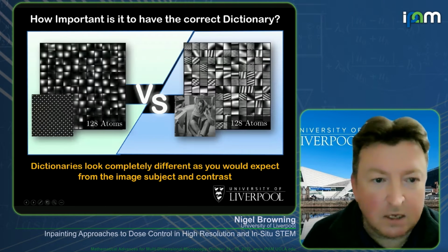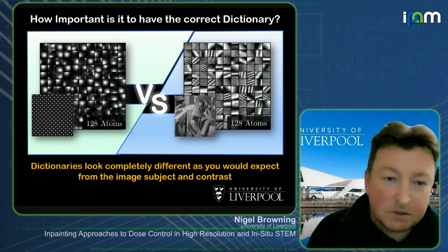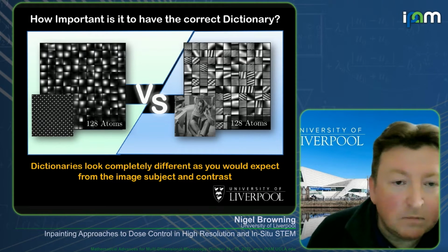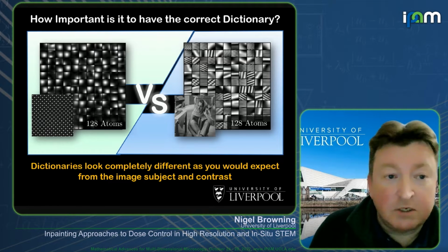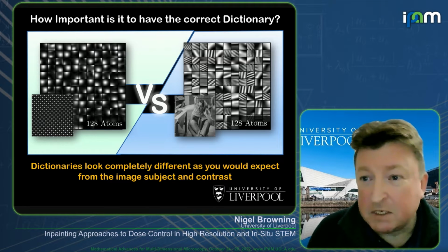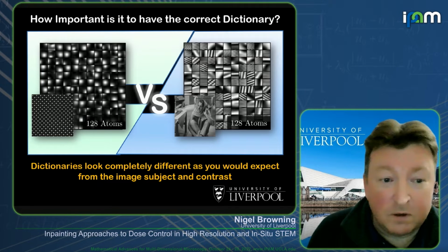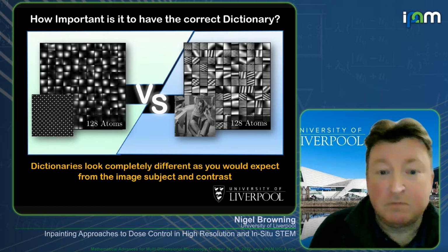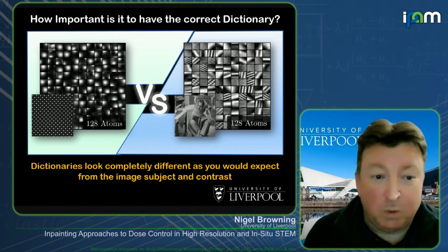And if we go through the process here, and you just use whatever method you want. I don't think this was done with BPFA because it's not subsampled. So we can get the dictionary, and you look at the dictionary, and it's sort of as different a dictionary as you could possibly get for an experiment. The one from the STEM image is all circles, and the one from Barbara is all stripes. And so you say, well, different dictionaries, were they going to work?